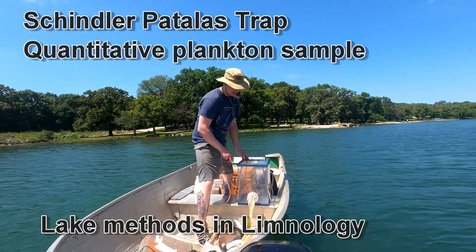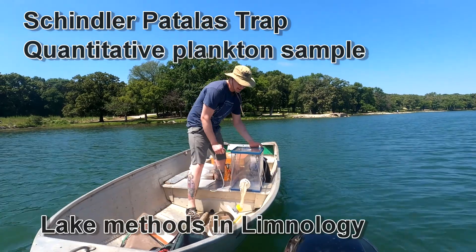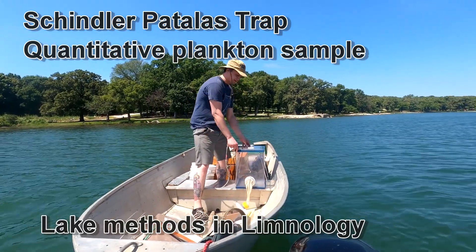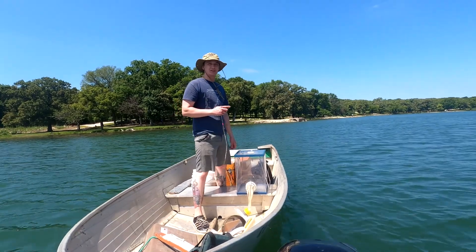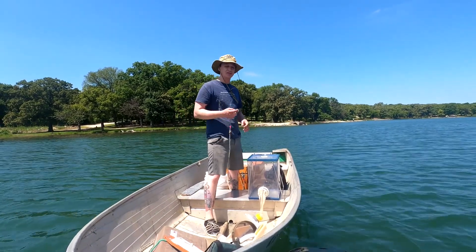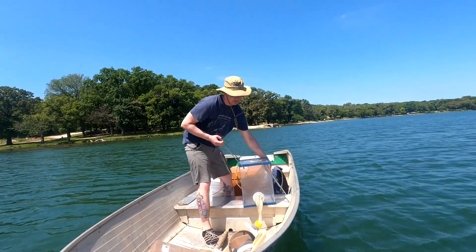There's a Schindler Fatalis trap. I'm going to use it to sample zooplankton in legs. It's a clear box — clear because zooplankton will actually avoid any colored objects. This is an attempt to avoid predators, so it's clear to make sure we don't scare the zooplankton out of the way.